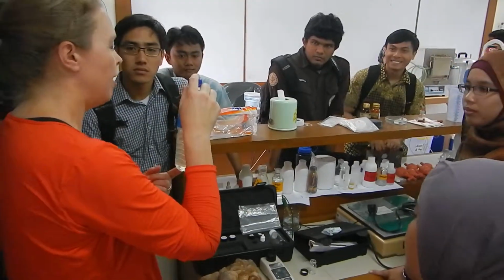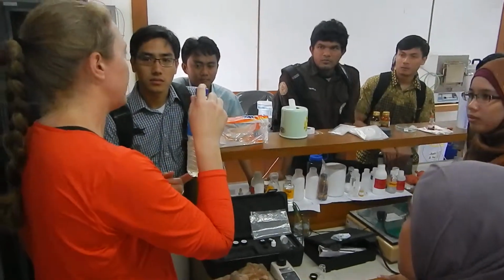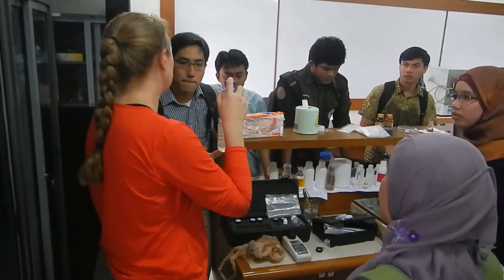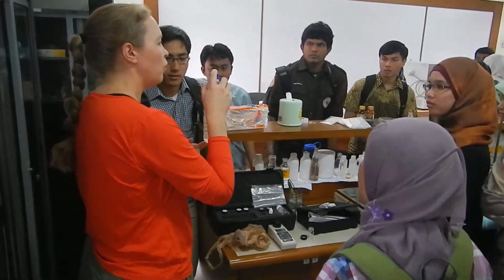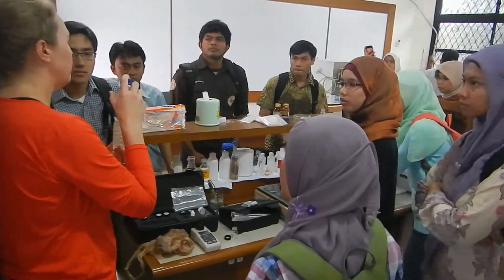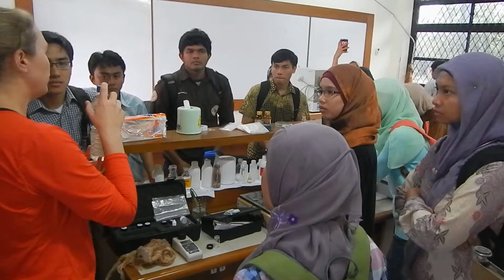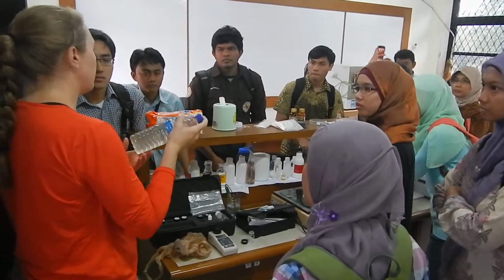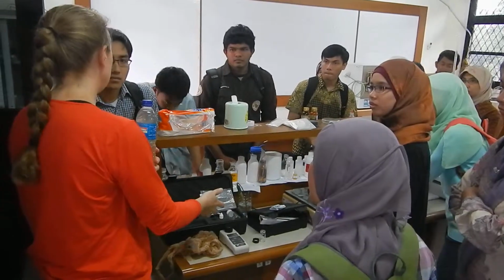Monitoring, I also look for, because we talked about yesterday about the sediments and things like that. One of the tests that I will run is total suspended solids. Okay? Well, running TSS takes a lot of time. Now, I have a new piece of equipment called a LISST, which will do it in 5 minutes and give me particle size analysis and stuff. But that costs a bit of money. But anyway, so it takes time to do this.